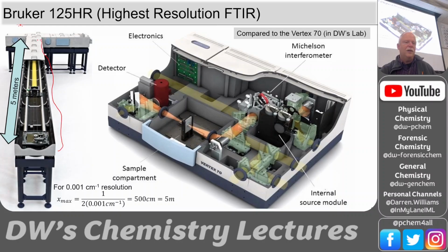This thing was so long. It basically went from where that trash can is all the way to the wall. So the spectrometer was down there at the end. It was kind of a small spectrometer. I mean, maybe the size of this bench. But then the interferometer was 5 meters long. Yeah, it was fantastic. Took a long time to take a scan because you had to move that mirror down and back. It had a little track and a cable that pulled it back and forth.